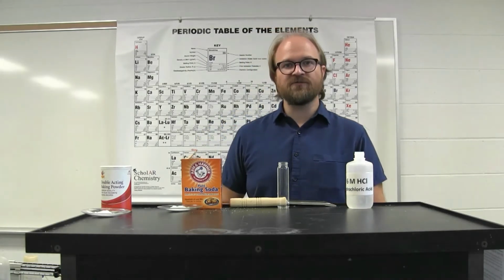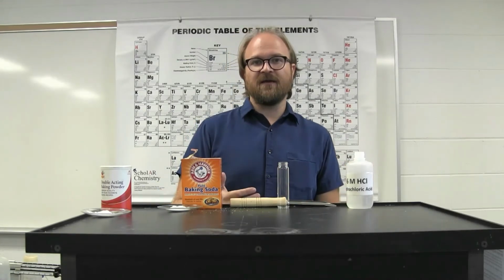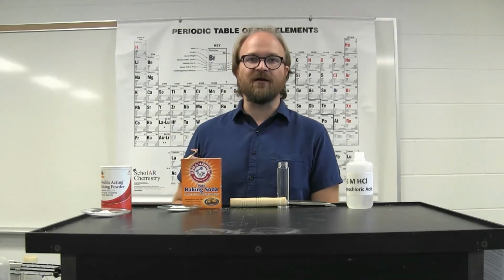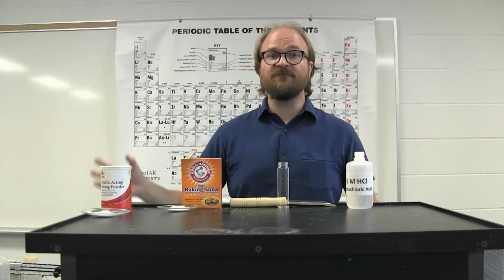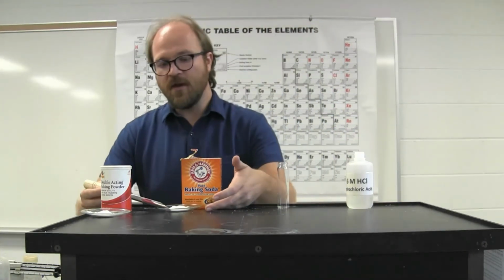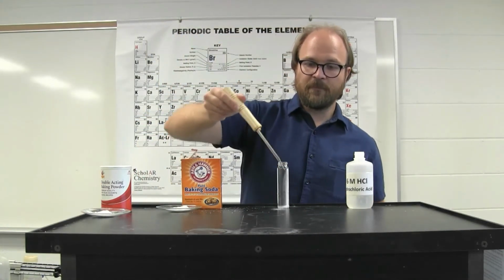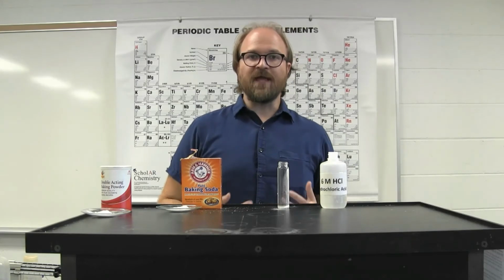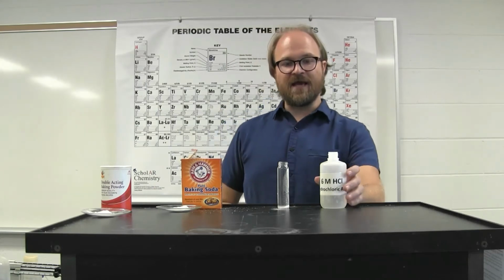However, using chemistry, you can take something that is difficult to measure and react it to form something that is easier to measure, to form an easily measured product. Then, using the chemistry, you can back calculate to figure out how much of that initial reactant there was. In this experiment, we're reacting carbonate with hydrochloric acid. When a carbonate reacts with hydrochloric acid, it generates water and carbon dioxide gas.